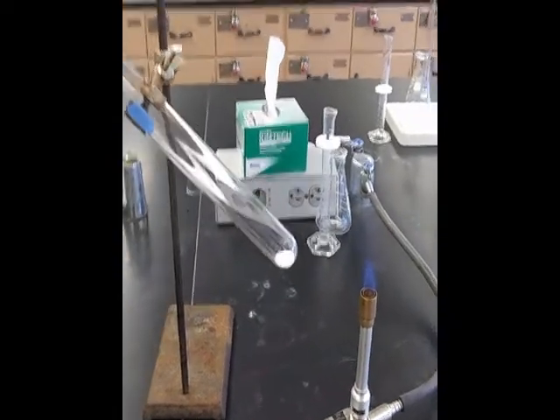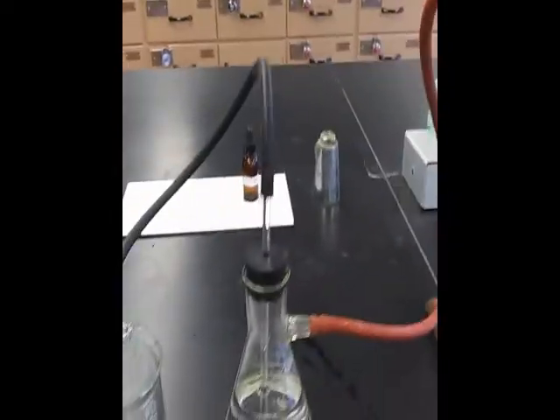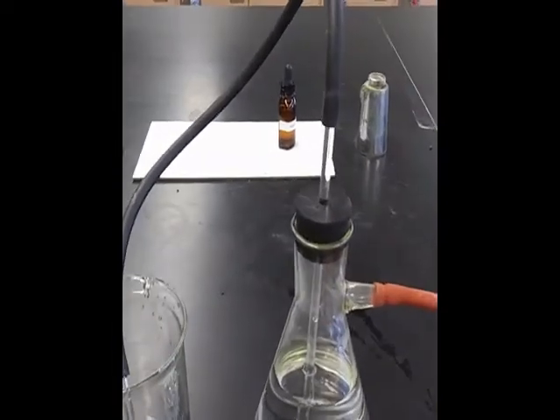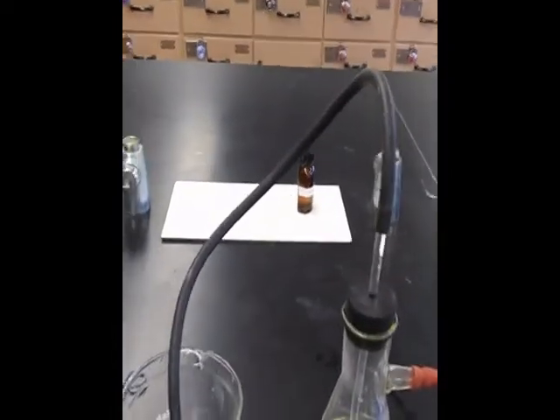So you can see here I've got potassium chlorate in the test tube, and it's connected by a tube to this flask. And then in the flask we've got some water, and then another tube going into a beaker. And I've set up a siphon here.